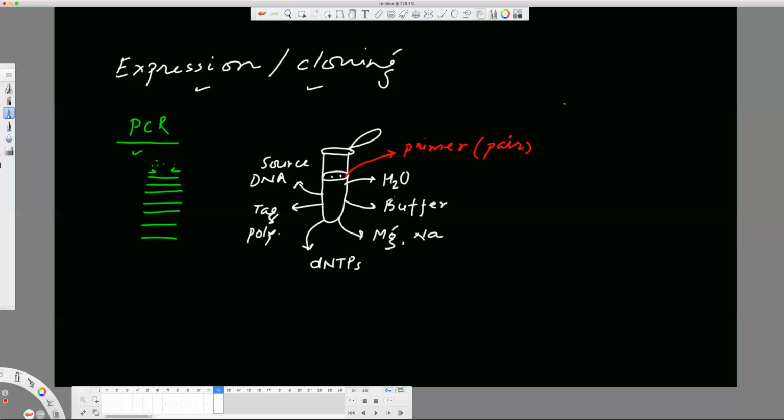How exactly you select the primer sequences is a computational problem. So what we are going to do today is we will learn something called primer designing. Now, designing is a misleading term here because we are actually not designing anything.